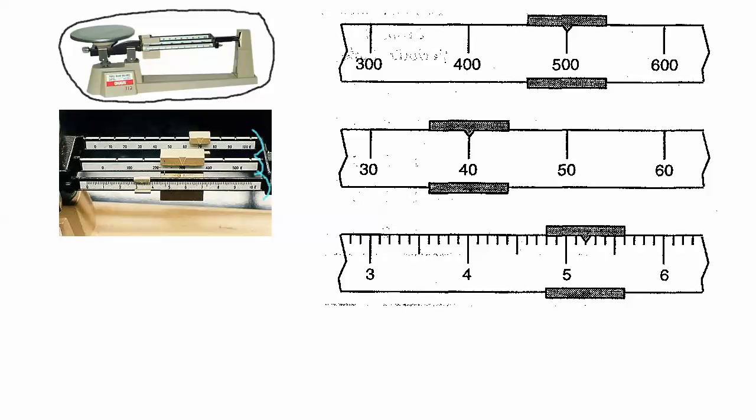As you can see in this picture, it's measuring hundreds of grams. And on the back one here, it's actually a little bit smaller. It's measuring tens of grams. So the way a triple beam balance works is that you move these little sliders to the right until your triple beam balance gets perfectly lined up over here, and then you read what the sliders are pointing at. So let's say that when it was perfectly balanced, my sliders looked like this.